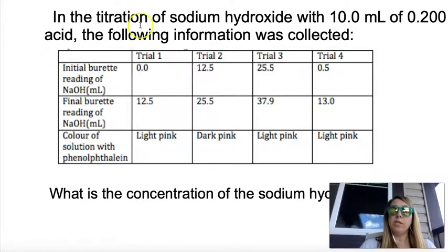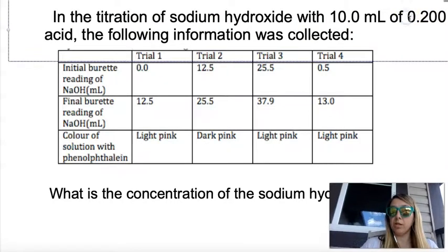So here we have the titration of sodium hydroxide with 10 mL of 0.2, I'm assuming it says moles per liter and it's just kind of off the screen.